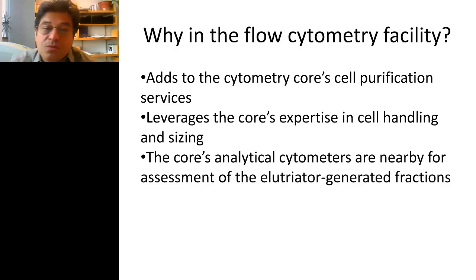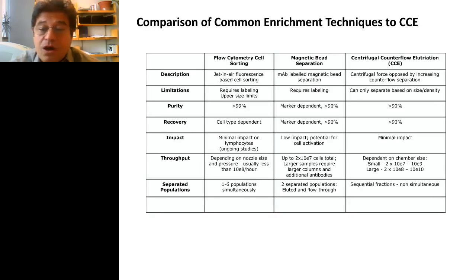Of course, to identify if fractions are the appropriate fractions of interest, you typically have to rely on a flow cytometer to do the analytical side of things. So having that nearby just made a lot of sense to us, and this is why we've been trying to integrate this into our core facility offerings.